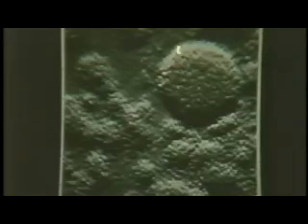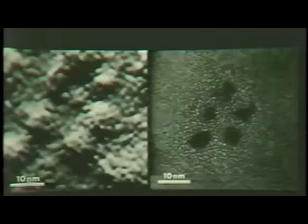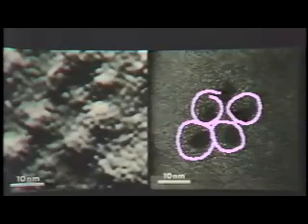This is a large one made up of individual ferritin molecules, but you can't resolve them because the resolution is only about 20 angstroms on this picture. This is the size of one ferritin molecule. That's what it looks like. In higher resolution, higher magnification, you see things sort of wash out. These are 4 ferritin molecules, and if you look at them in the electron microscope at the same magnification on a different sample, you see the iron-rich core, and these molecules are separated by the invisible protein shell that surrounds them. Roughly the same size as the features we see.